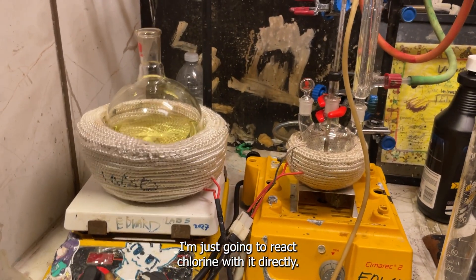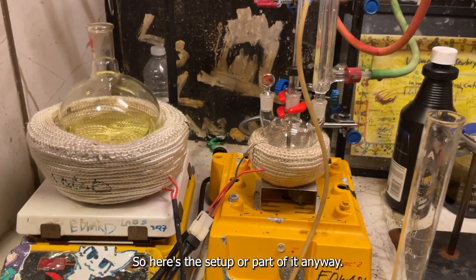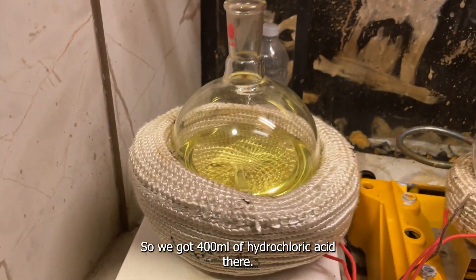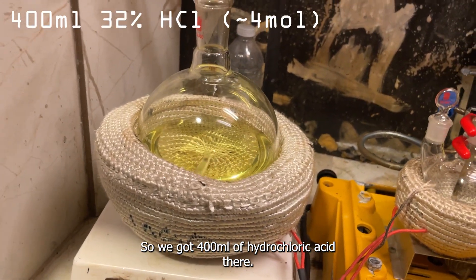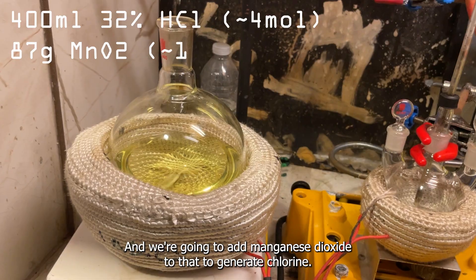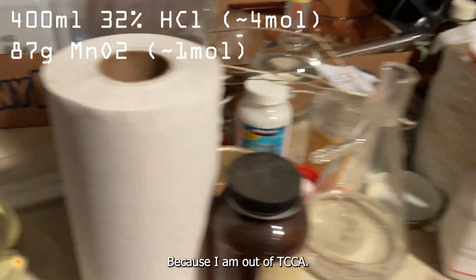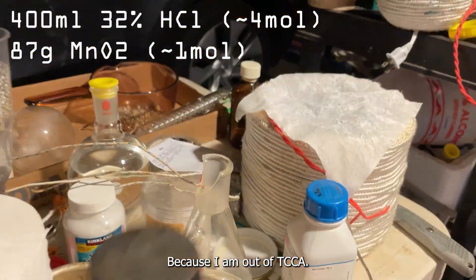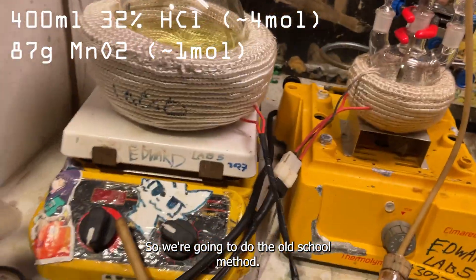So here's the setup, well part of it anyway. We've got 400 milliliters of hydrochloric acid in there. And we're going to add manganese oxide to that to generate chlorine because I am out of TCCA. So we're going to do the old school method.